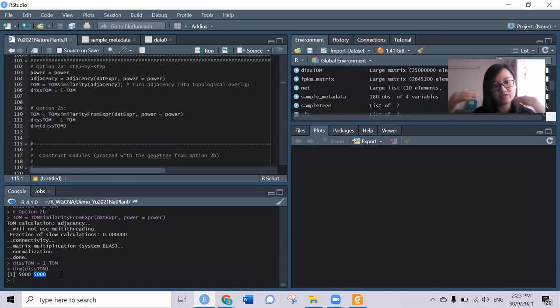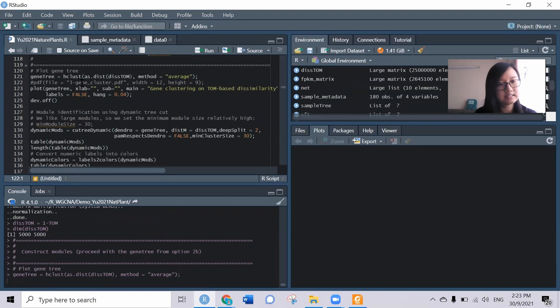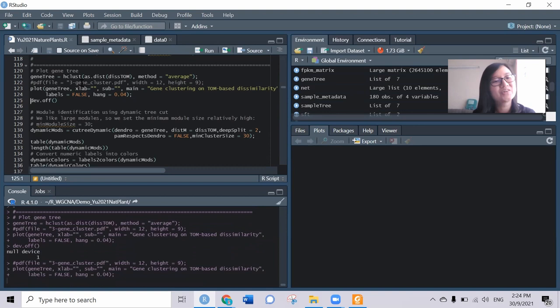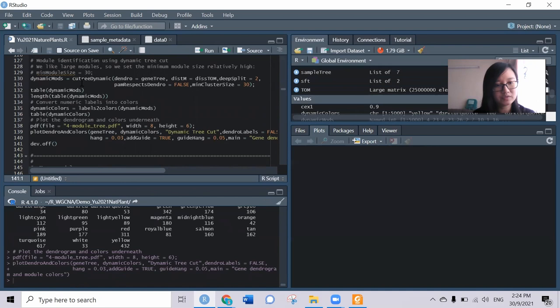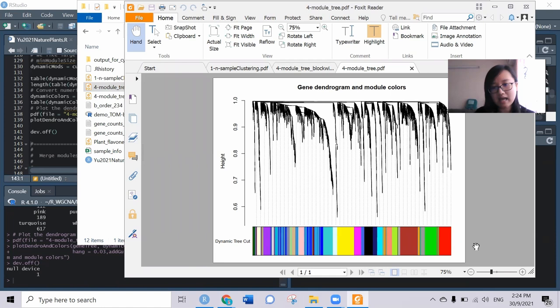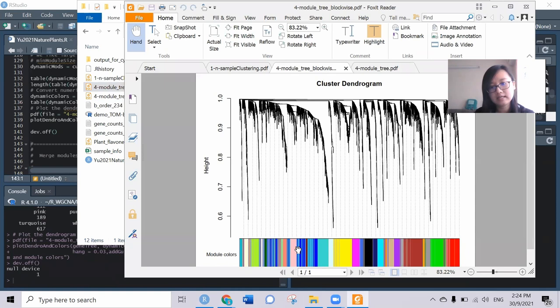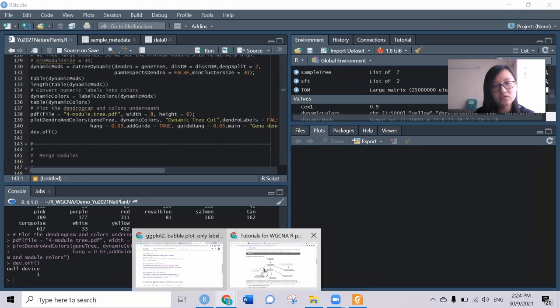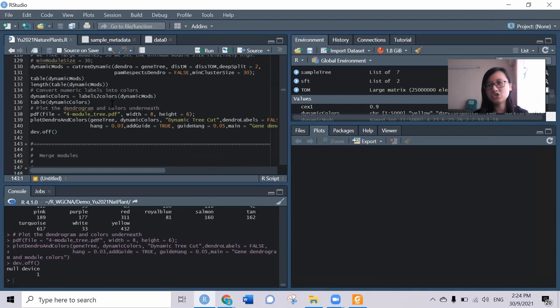We can try to plot the genes and see how it looks like. It will be something like this. If we compare them with the dendrogram constructed using the block-wise modules, it's something like this. This is the dendrogram and module assigned for the step-by-step function, and this is the one-step function that used the block-wise module function. You can see not much difference between both of them. This is also demonstrated in the tutorial by the author - there's not much difference.